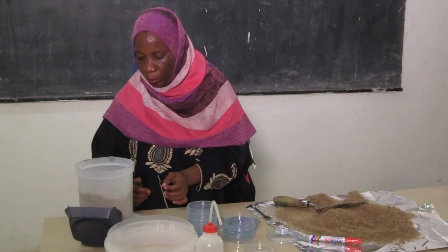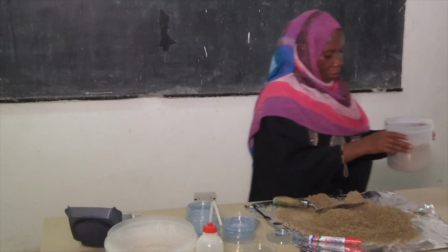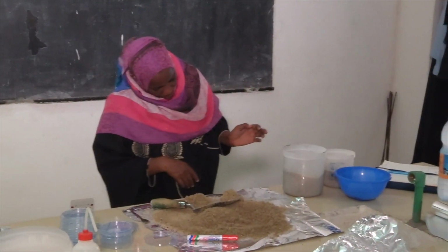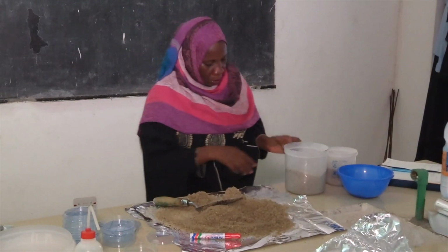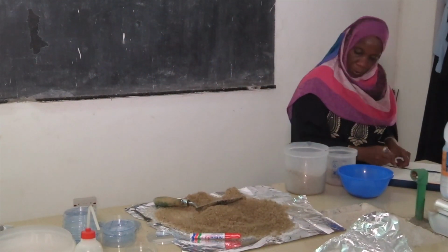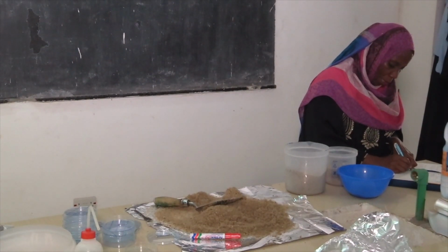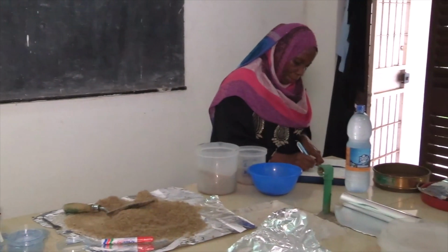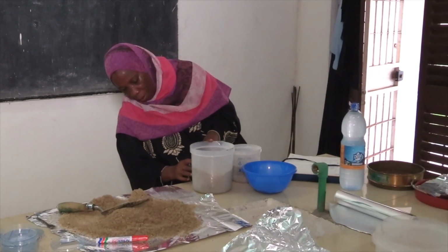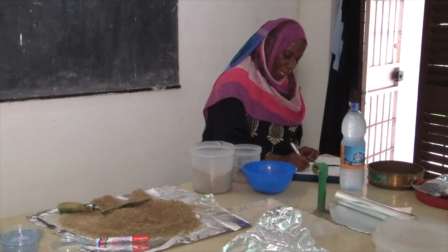Replicate 2. This is 2 kg. So this is 1012. So 2 kg, replicate 2, rest. This is 2 kg, and the volume is 1.2 liters.